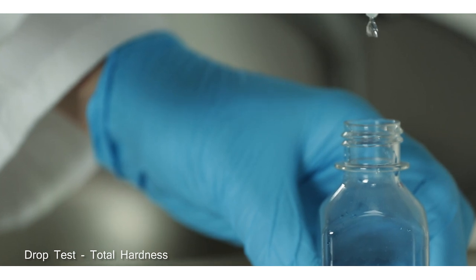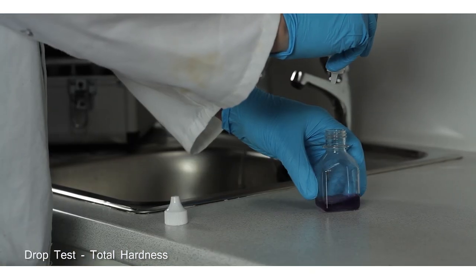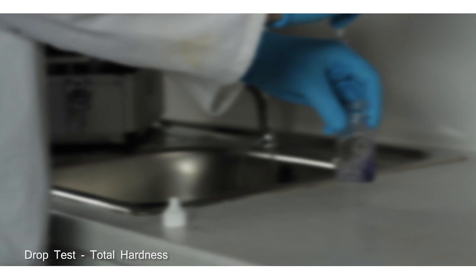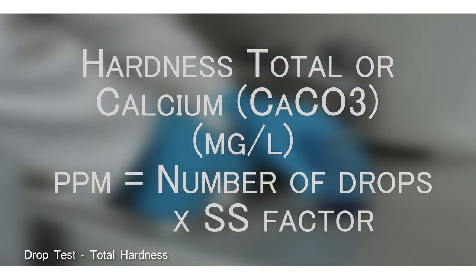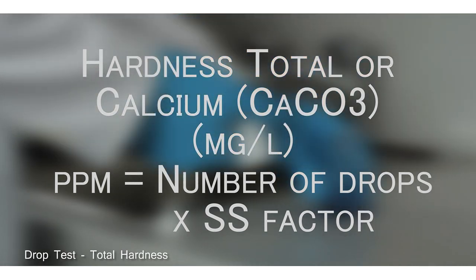Count the number of drops of your chosen titrant until the sample turns from red to blue. The number of drops times by the SS factor equals total hardness in milligrams per litre.